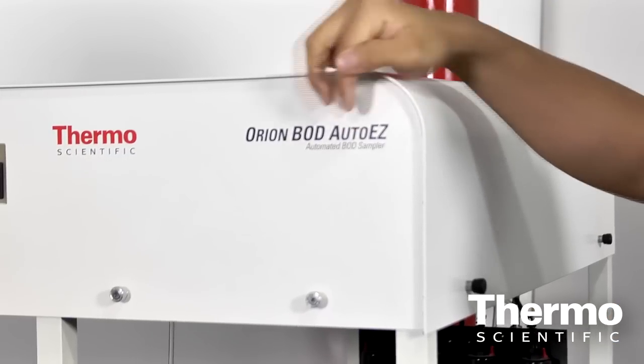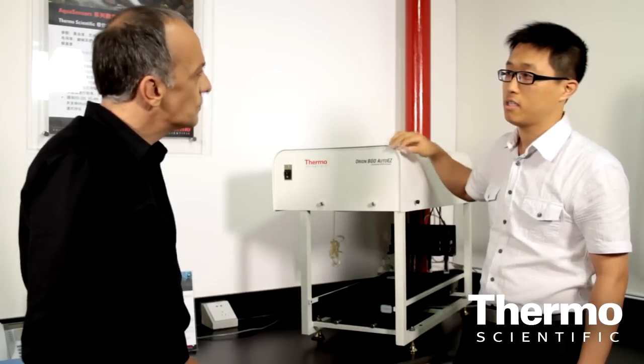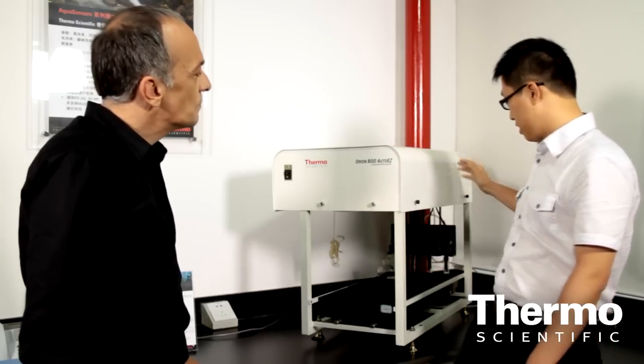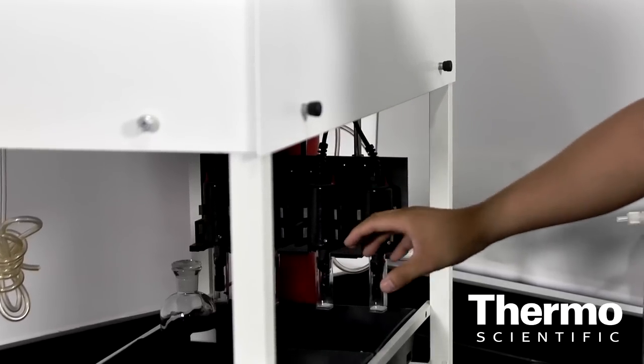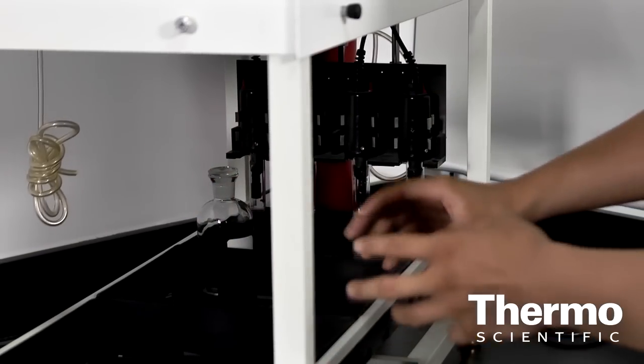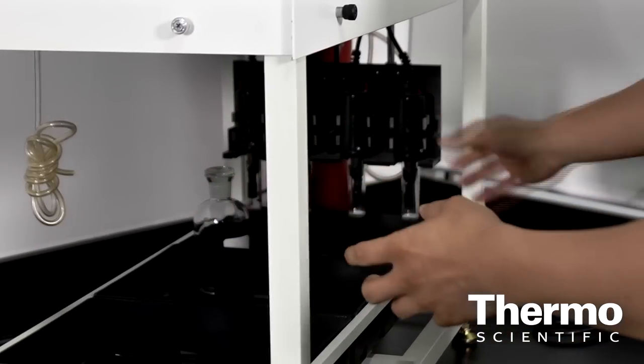Talk about the innovation. Its standout features are the Auto and Easy modes. It has a four-channel design structure with four dissolved oxygen probes and simultaneous sample detection. If the three trays underneath are fully loaded with samples, that gives a total of 36 samples.